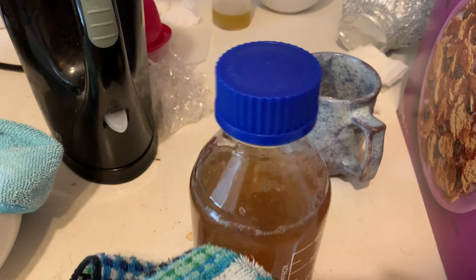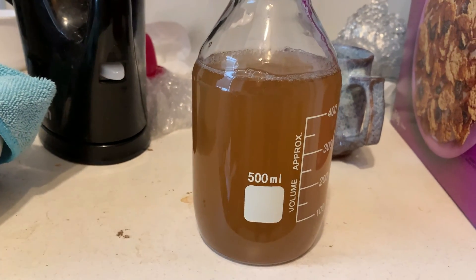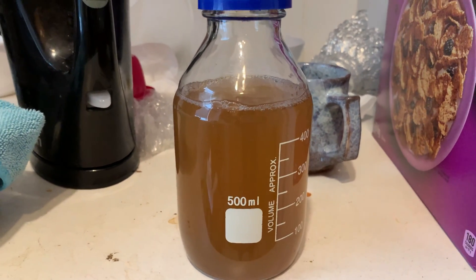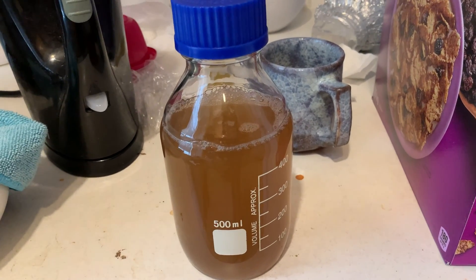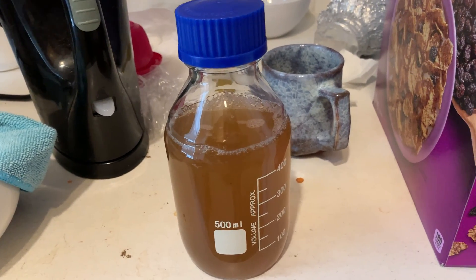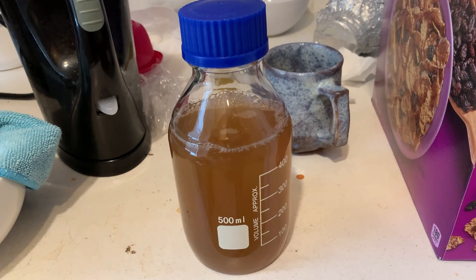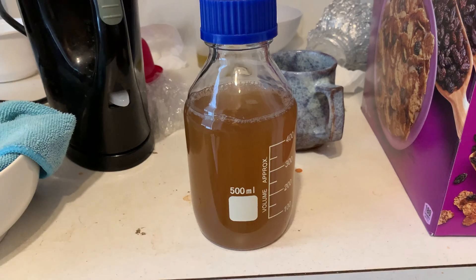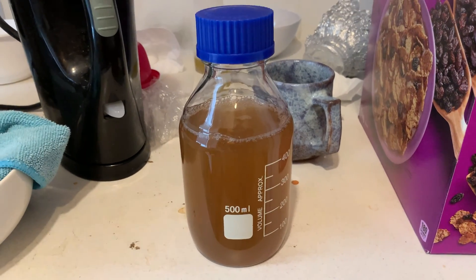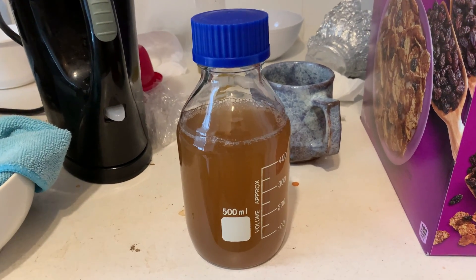As a recap: once agar solidifies, to re-liquidify it you want to heat it back up to 85 degrees Celsius — that is 185 degrees Fahrenheit. Once you get it back up to that temperature it'll become liquid, and then you just wait for it to cool down and you can pour it again. The microwave is a great way to do it — very easy.